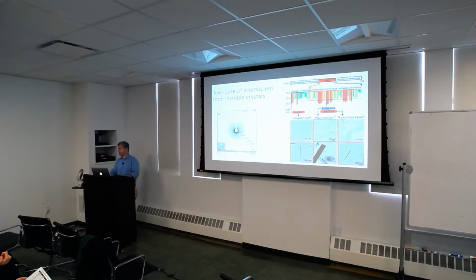So you just don't get enough through it, or what does get through it has been scattered a couple of times, so it's no longer at the right point where it should be. All of the diffraction theory assumes only one scattering event. So if it scatters twice, it ends up contributing to the wrong spot, and then that messes up your intensities.